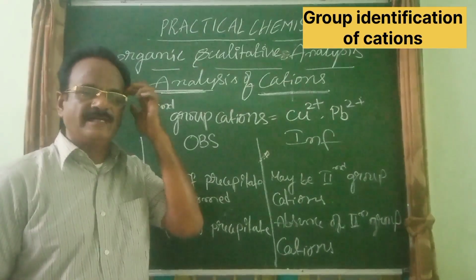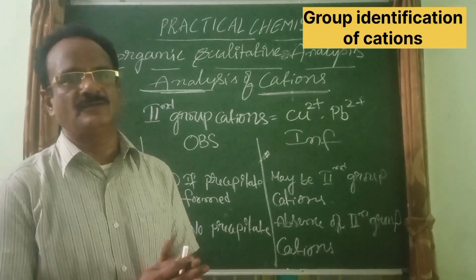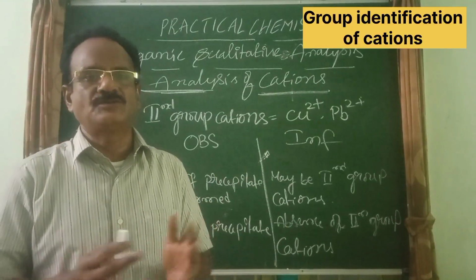Here, one has to take the original solution into the test tube, and then it is added with dilute HCl, and then it is added with H2S gas.